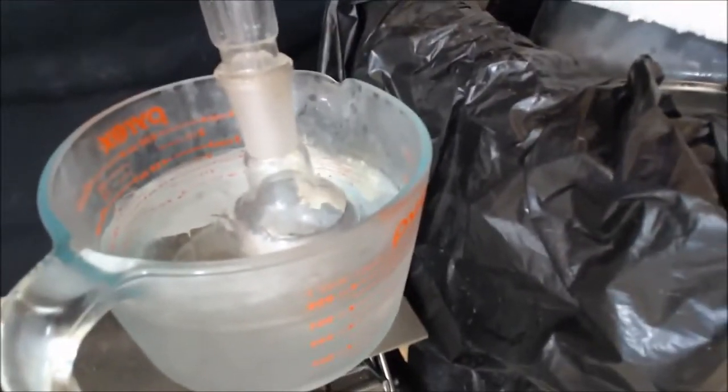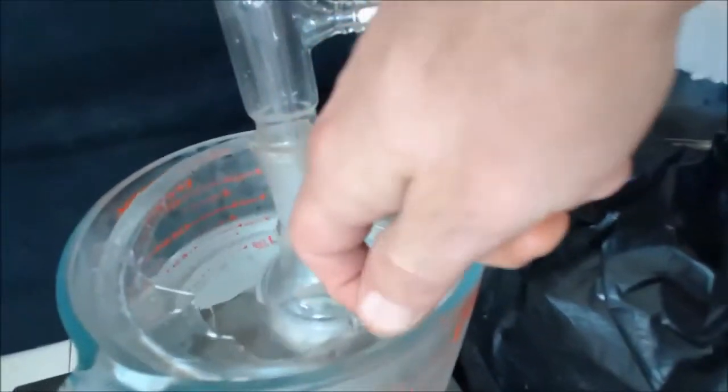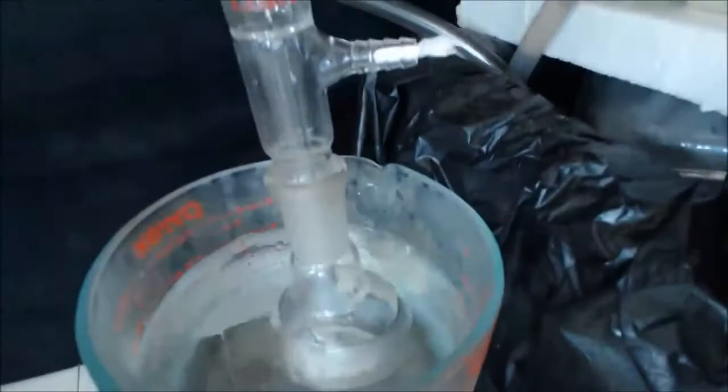I got the receiving flask. See how it's got ice in there. That little puddle right before the condenser, you can see it right there. That's my entire yield. That's it, those couple milliliters. So I really botched this. I don't know if it's because I don't have the stir bars, or maybe I needed to heat it up super hot. I don't know what the deal is. Always remember, science is great.